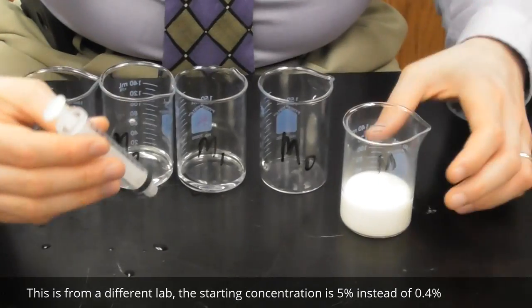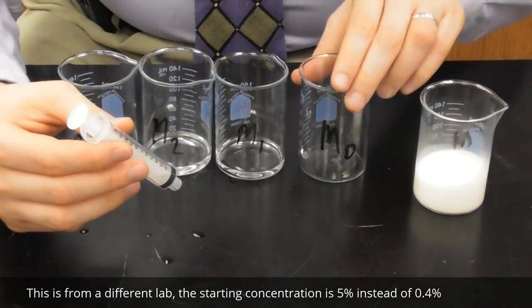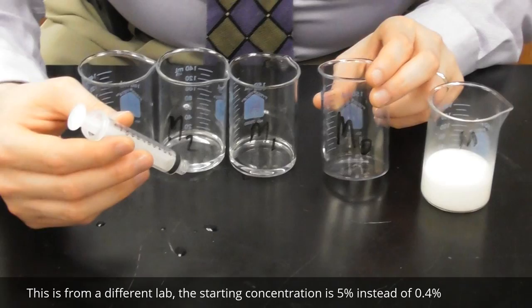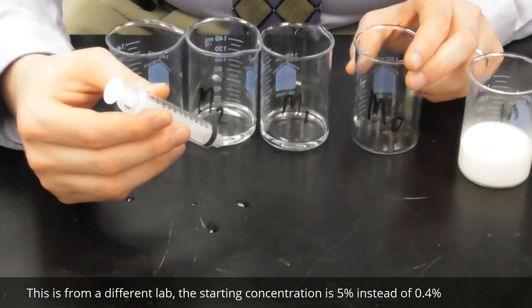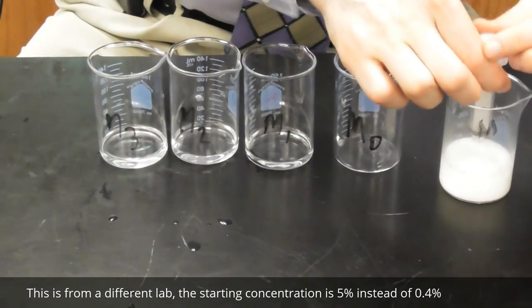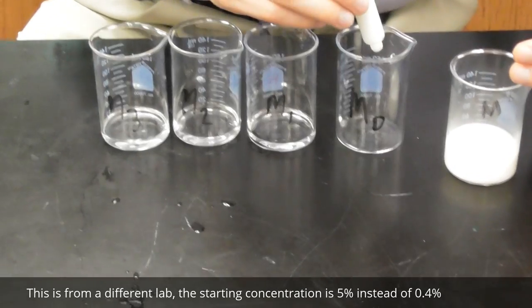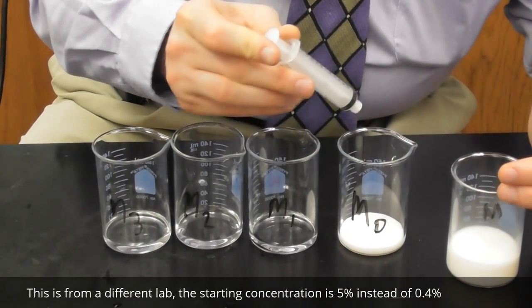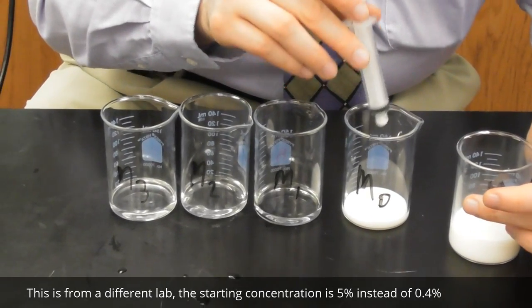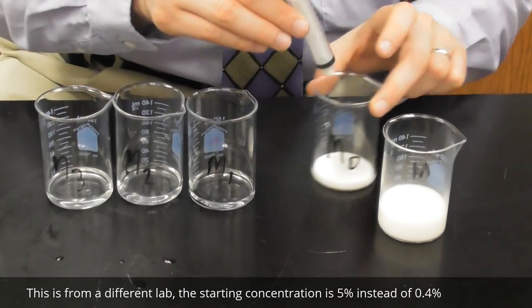Next step. 5% triglyceride. M0 is the original solution. Now, I'm going to be taking 20 cubic centimeters into M0, and then I'm going to be taking half of that out and putting it into here. Okay, so 10 cubic centimeters can go into here for M0. But wait a minute, if I'm just going to be taking 10 out of here and putting it into here, why bother putting any more in here?